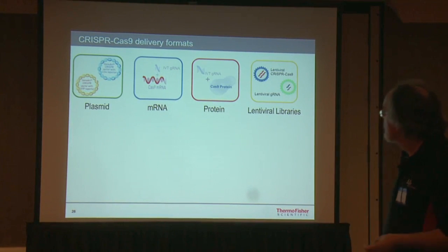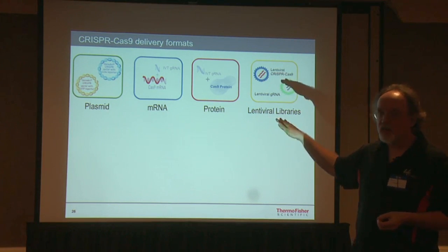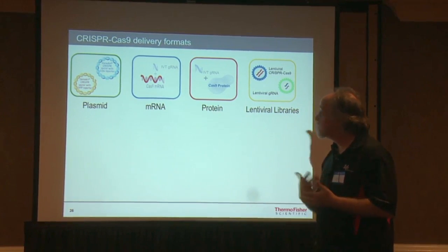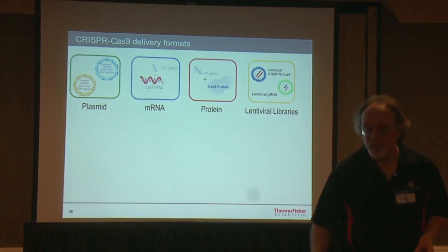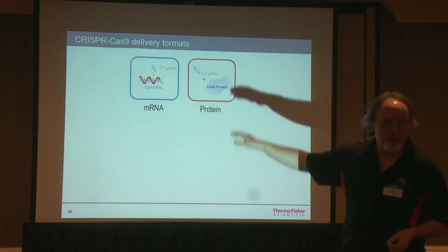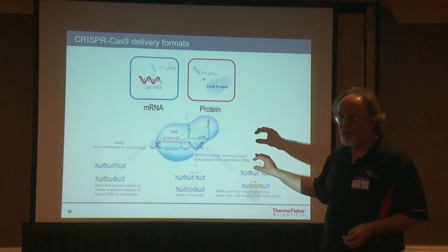Now, looking at these individual delivery formats, to emphasize the point, we've got 4 different formats. If I was a biologist in the laboratory looking at this, I would have to work with somebody to figure out what the best way of doing this is and why. An awful lot of the time, this is anecdotal evidence you only learn by doing experiments in the laboratory with somebody. You may find out, after working with us for a while, that the best approaches are either of these two, and you then may be guided towards particular ways in which you should do that experiment.